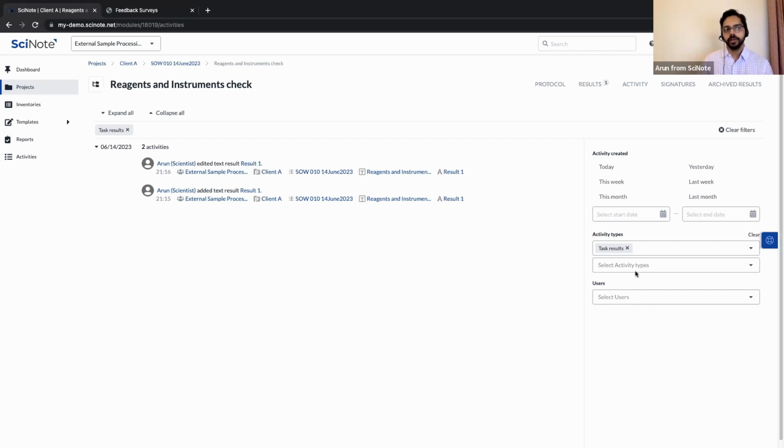So once you've narrowed down the information here to a specific date range, then you can go back to the audit trail, input that date range, use the filter for either result, step, protocol, etc. And that will help you find what you're looking for a little faster.